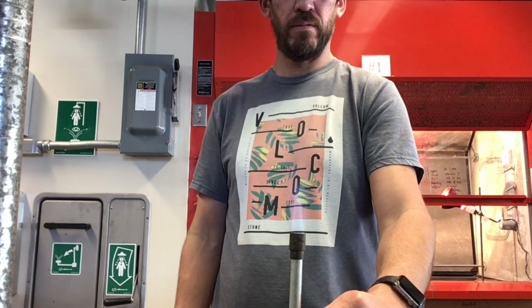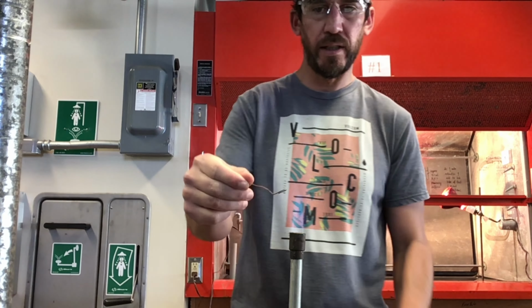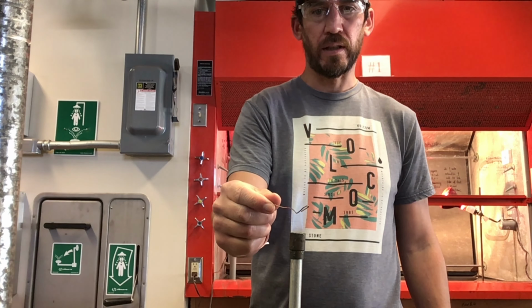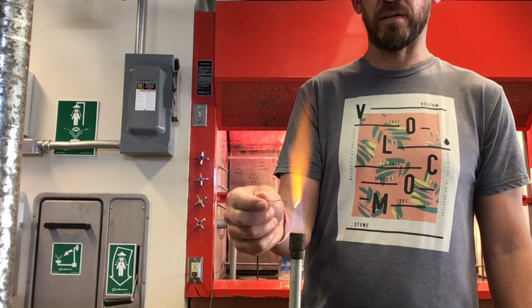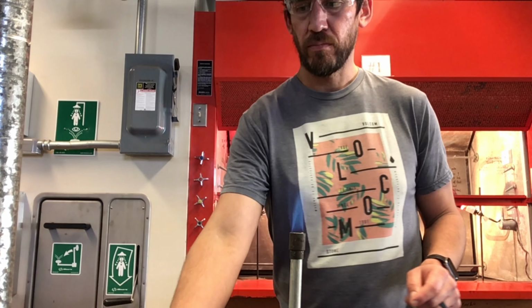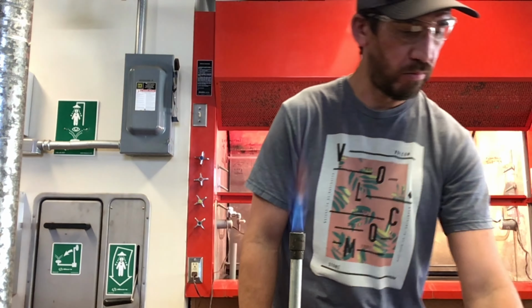Simmer down. That's a good looking flame right there, so hold it in. Got a little color to it, huh? You see that green? Gorgeous. Okay. Now, don't hold it in there too long, because that copper gets hot.